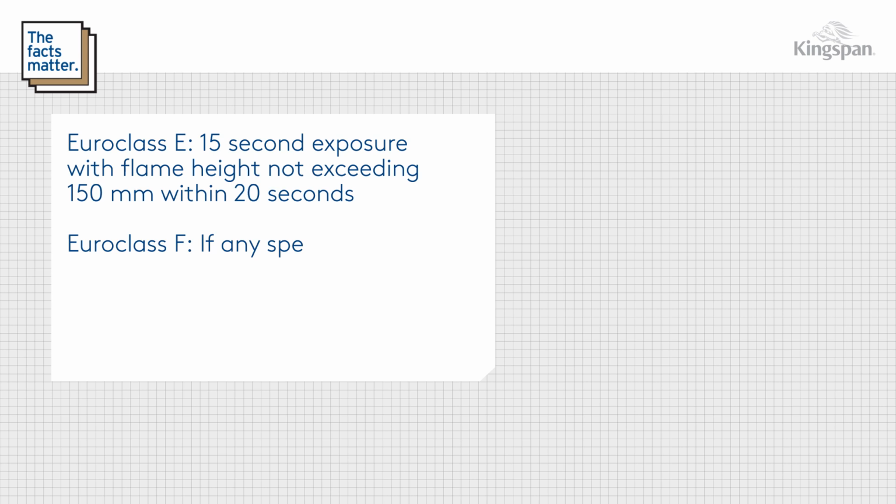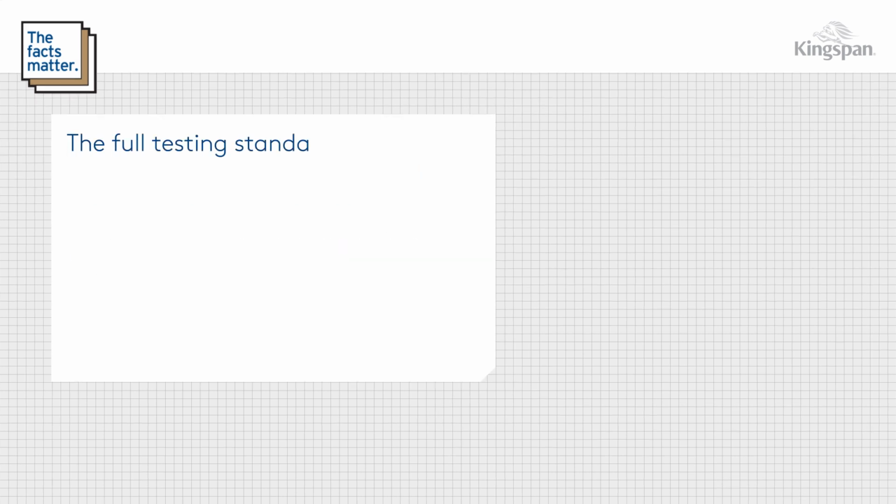Euroclass F, if any specimen fails to obtain Class E. The full testing standard can be downloaded from your local national standards body.